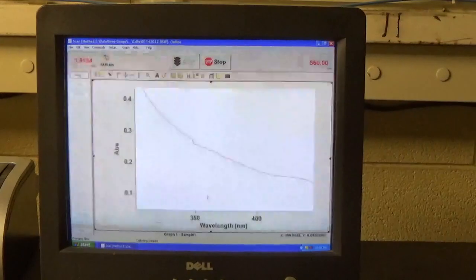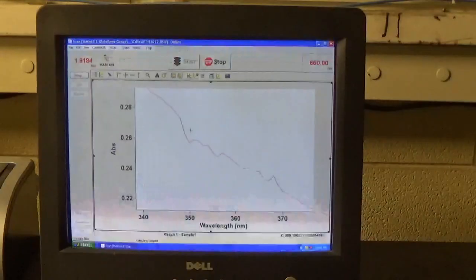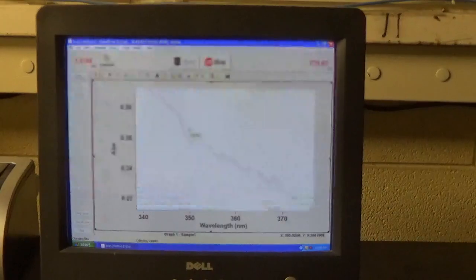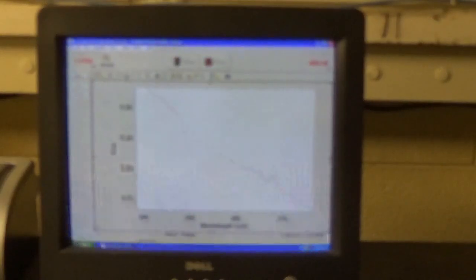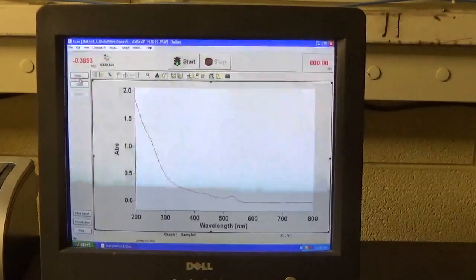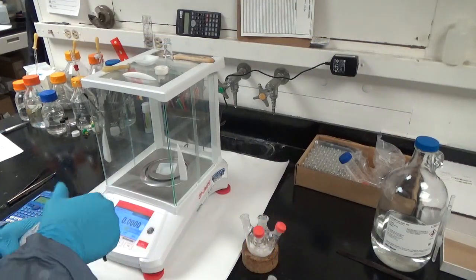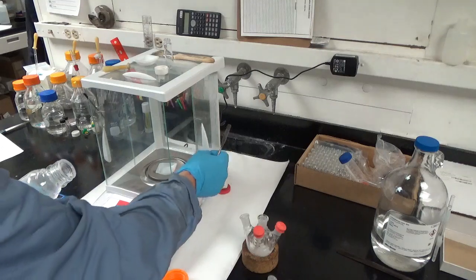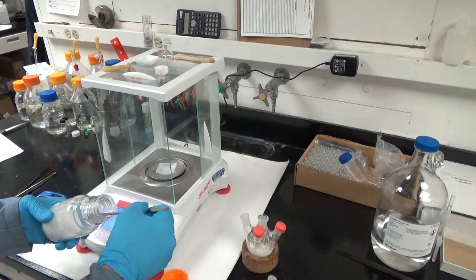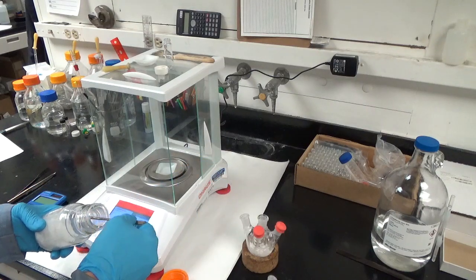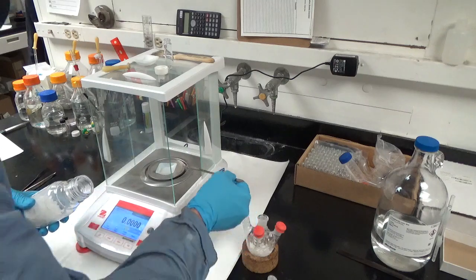My regression for calculating the concentration of QDs in my stock is based on knowing the first absorption feature, which tells me the size, and then the absorptivity at 350 nanometers for which I have the Beer's law coefficient.